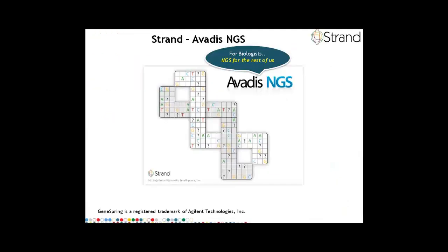As most of you might be aware, Avadis NGS is a next-gen sequencing product which has been in the market for a year and a half now. The USP of the product is that it makes analysis simple to carry out for biologists. It is developed on the same platform as GeneSpring. So those of you who are using GeneSpring for microarray analysis will find the look and feel of the tool very similar.